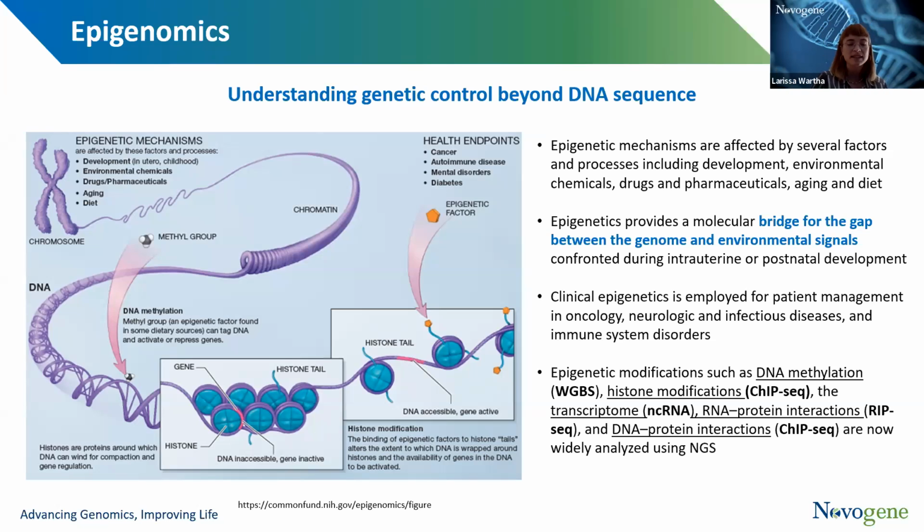Yeah, of course, different material is different, and you're more likely to get very fragmented and degraded material, especially from patient samples. For example, FFPE and even cell-free DNA can be low in concentration. Therefore, we have different input requirements for these different starting materials.